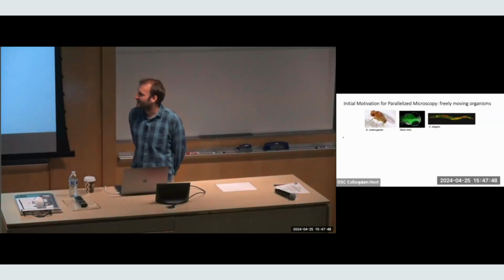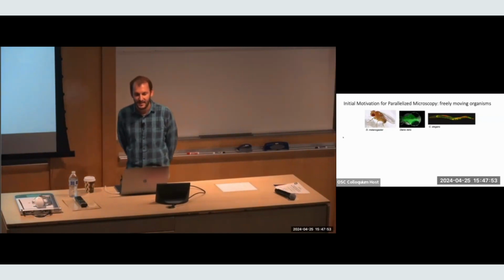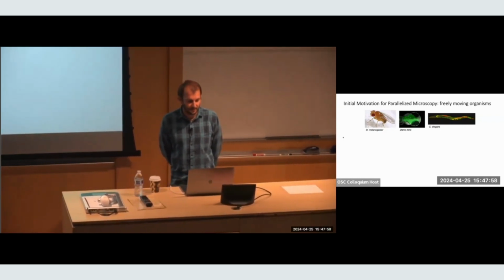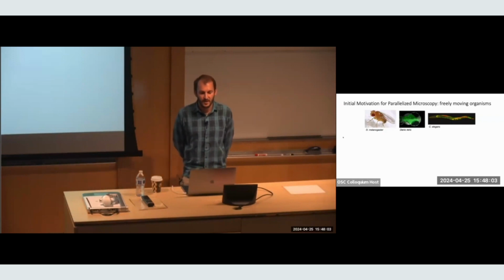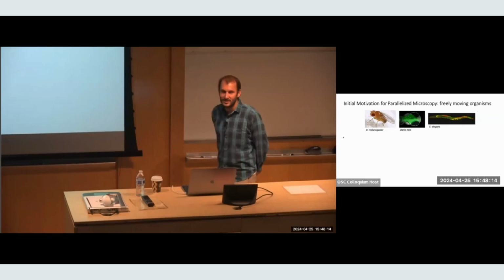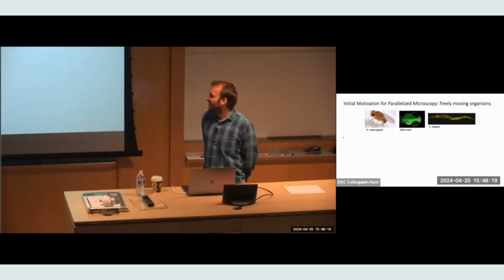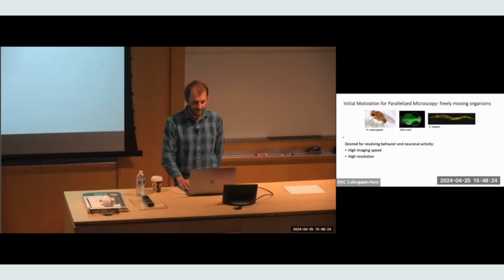And so this talk is about some of the technology we've been developing over the past 5 or 6 years now, really since I was in my postdoc time. During that time, I was in a lab that was working a lot with model organisms. There are a lot of different model organisms, but smaller ones that are useful for microscopic study include the fruit fly, the zebrafish, or Danio, and C. elegans, which you may have heard of.